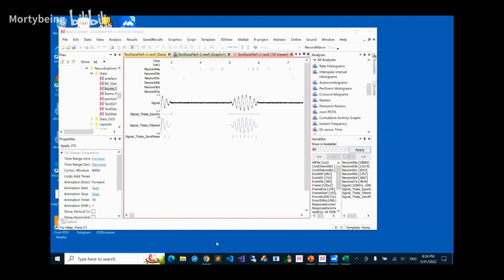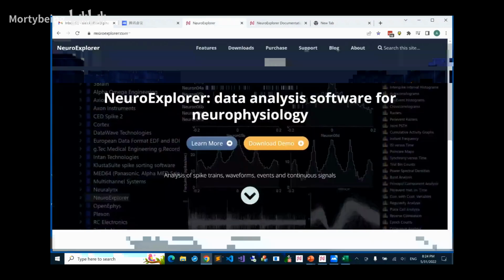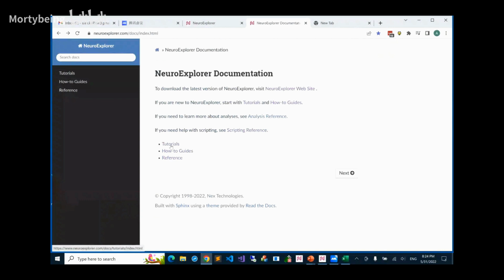You have the tutorials, with a few analyses described step by step.